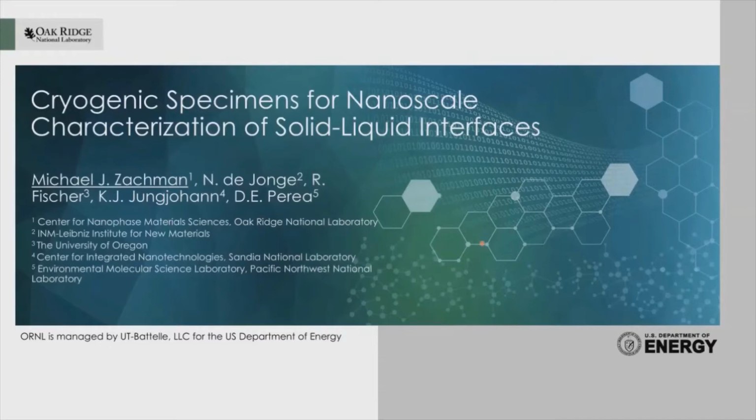In my experience, my PhD at Cornell was all in these cryogenic techniques for energy storage materials. And then I'm going to show you one that Danny Perea here, the last author, uses for atom probe tomography. He looked at some corrosion of materials.